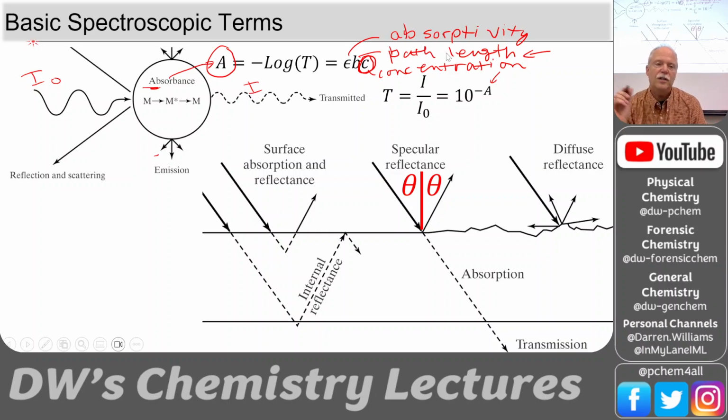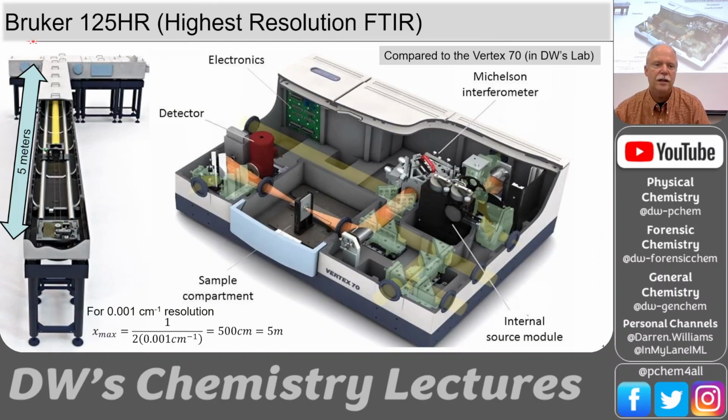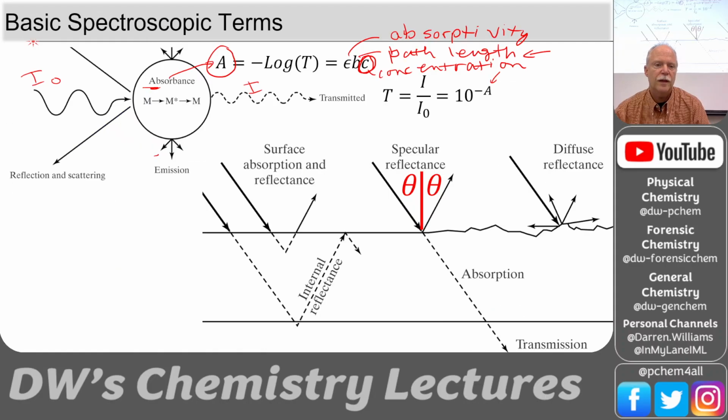Okay, and then we have just talked about the scattering. We did the Rayleigh scattering. So we have this Rayleigh and Raman scattering, and then we have reflection.